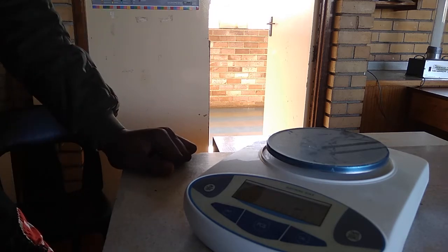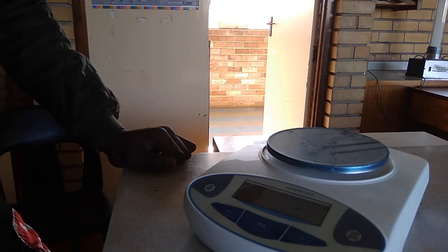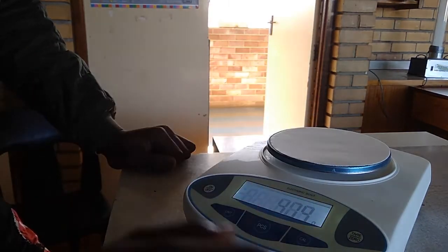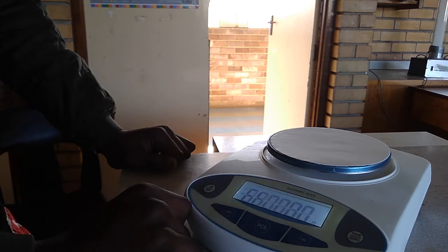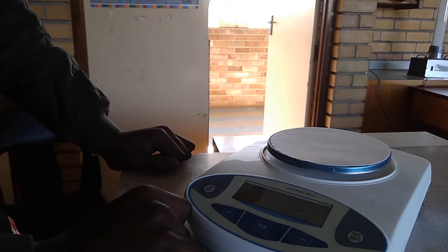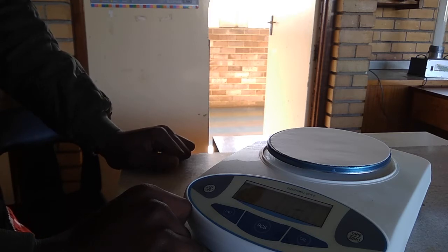0. Now, Pascal, what we do is just grab a piece of filter paper, and then put it onto the scale, and then switch it on and off again. That's off, now it's on. Now watch what's going to happen. It goes through a whole routine, right? And now what's it measuring? 0 again. So we say that the scale is zeroing itself with a piece of filter paper on now.